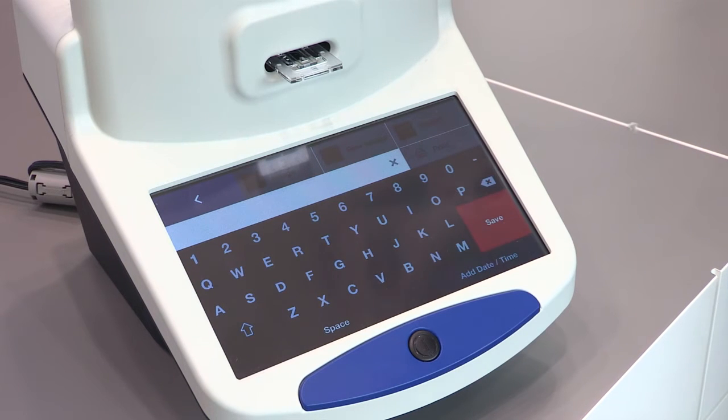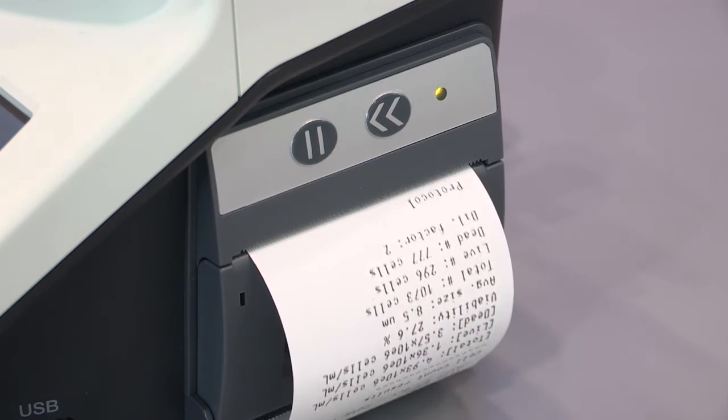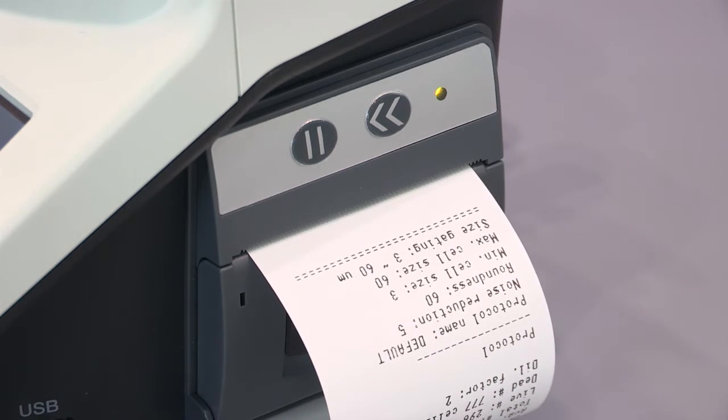The PDF contains the complete statistics plus the histogram and the original images that have been taken in the system. Alternatively, I can also press print, and there is an integrated printer on the side which gives me a full report of this cell culture.